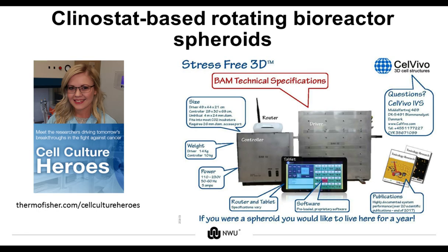Here at the Center of Excellence for Pharmaceutical Sciences, we culture our 3D spheroid cell models in clinostat-based rotating bioreactors on a Cellvivo system. Dr. Carla Michalis described this system comprehensively in her webinar of the 24th of May, which is still available on demand at LabRoots. Basically, each Cellvivo system consists of a driving unit, wireless communication, and an environmental control.